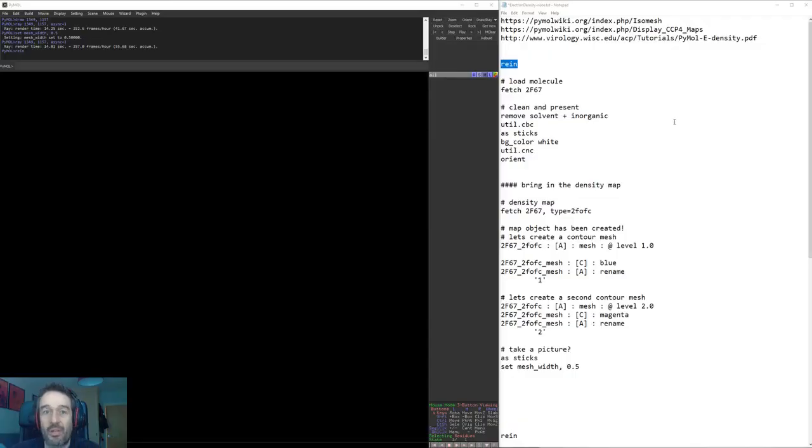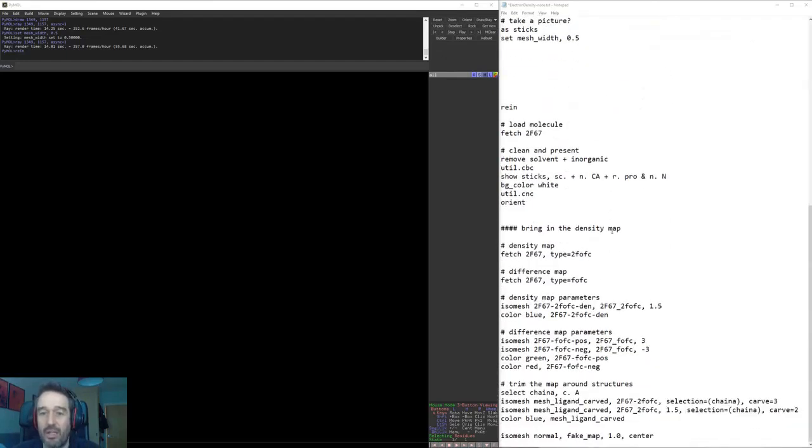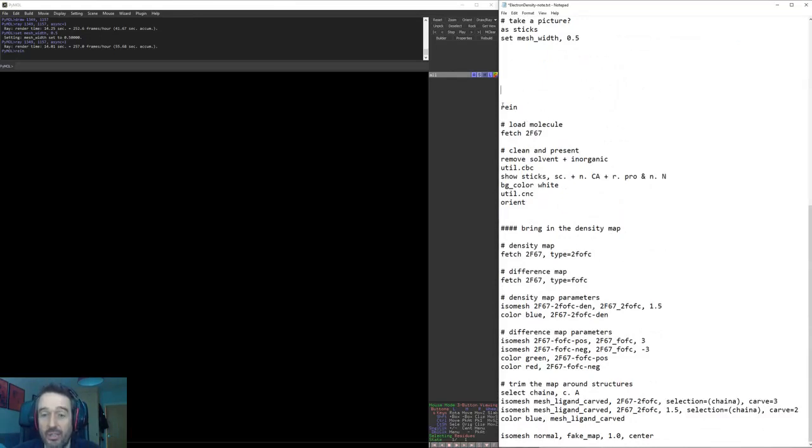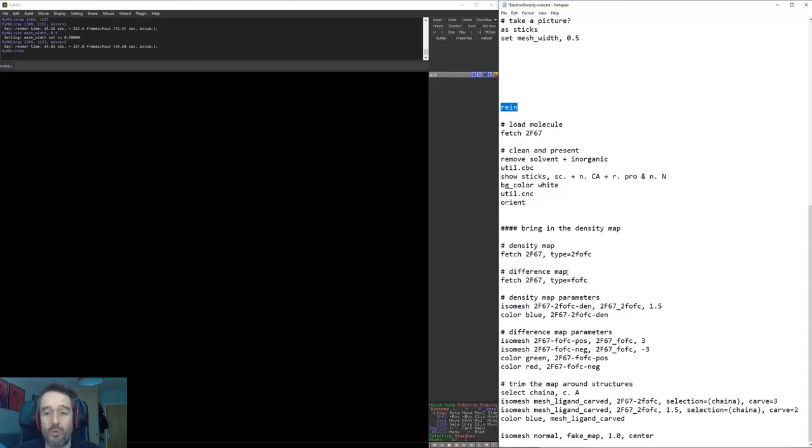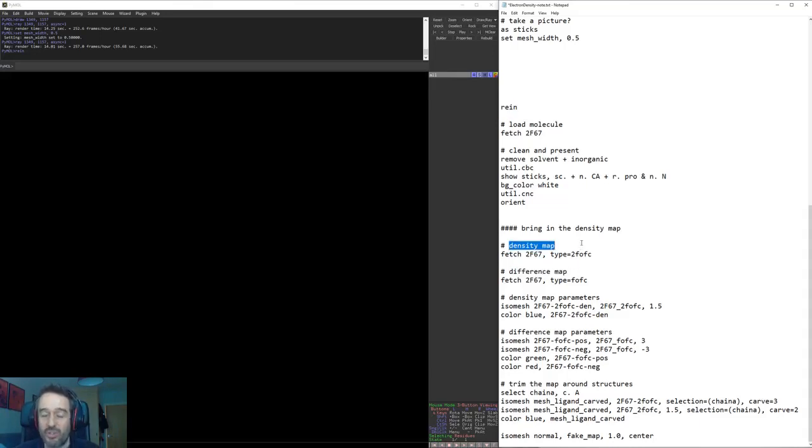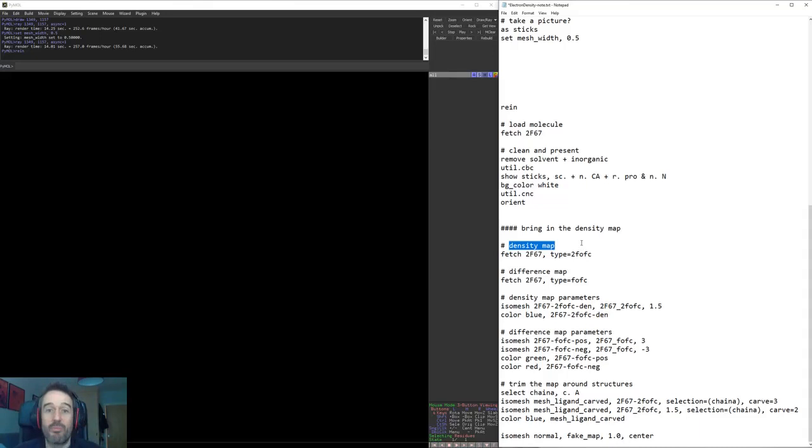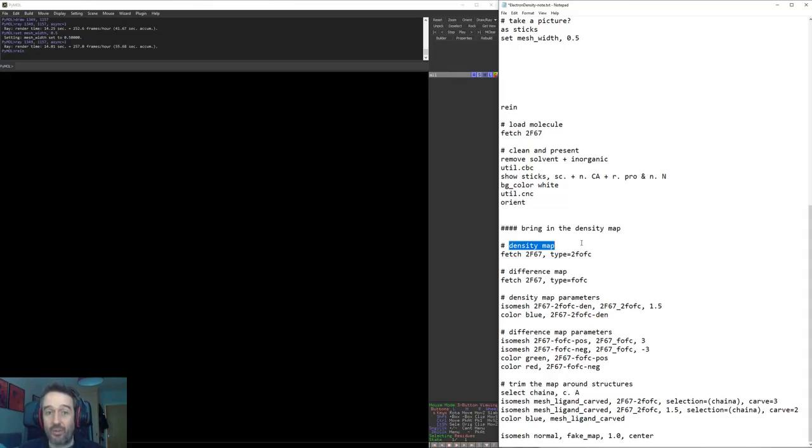Okay, so we've learned how to use the GUI. How about just using the command line in order to visualize our electron density? We're going to use some of the same commands that we used before. This time what we're also going to do is open up something called a difference map. What we looked at before was the density map which shows an agreement between the electron density computed from the X-ray crystallography diffraction pattern, the agreement of that with the position of the atoms in space.